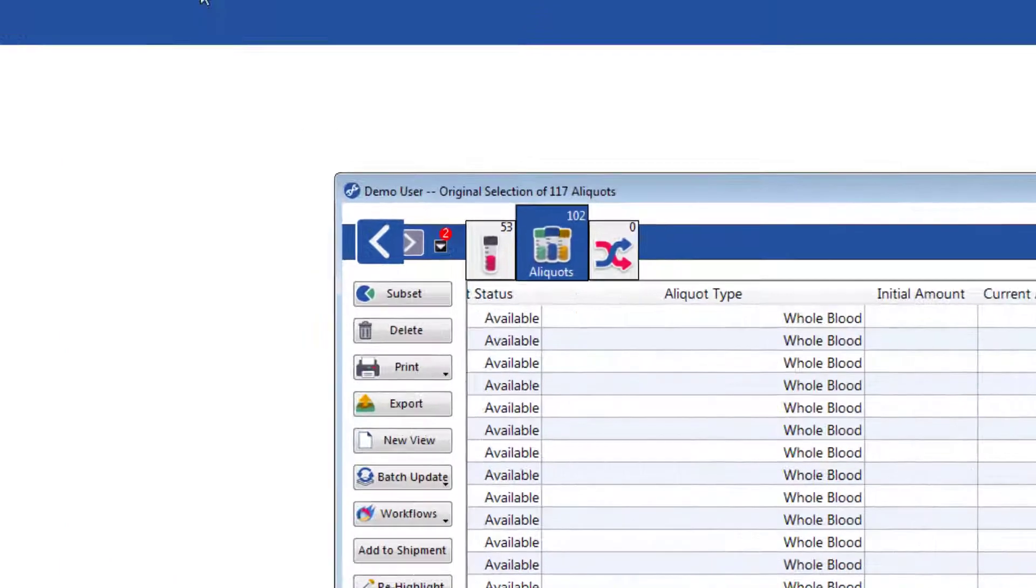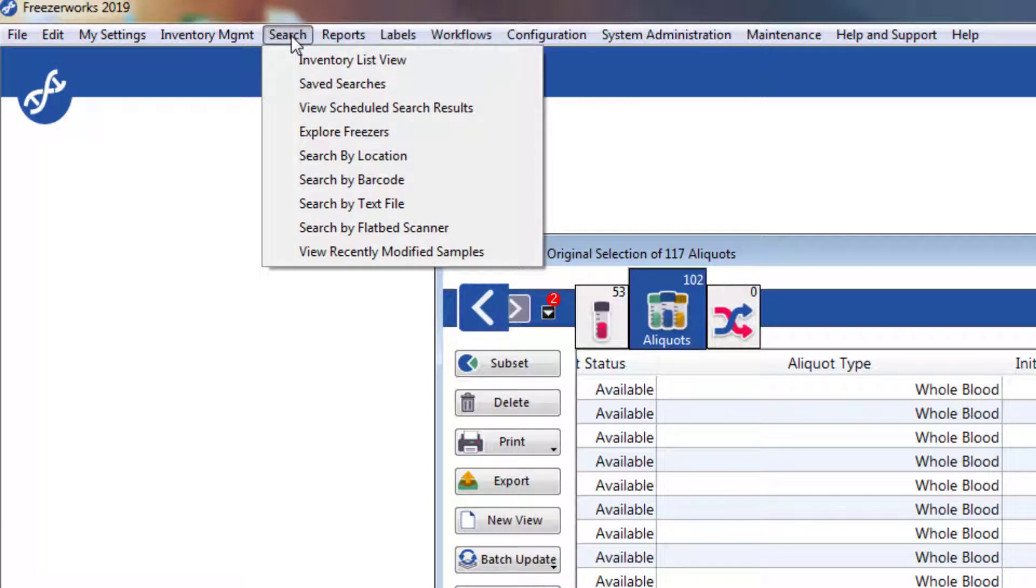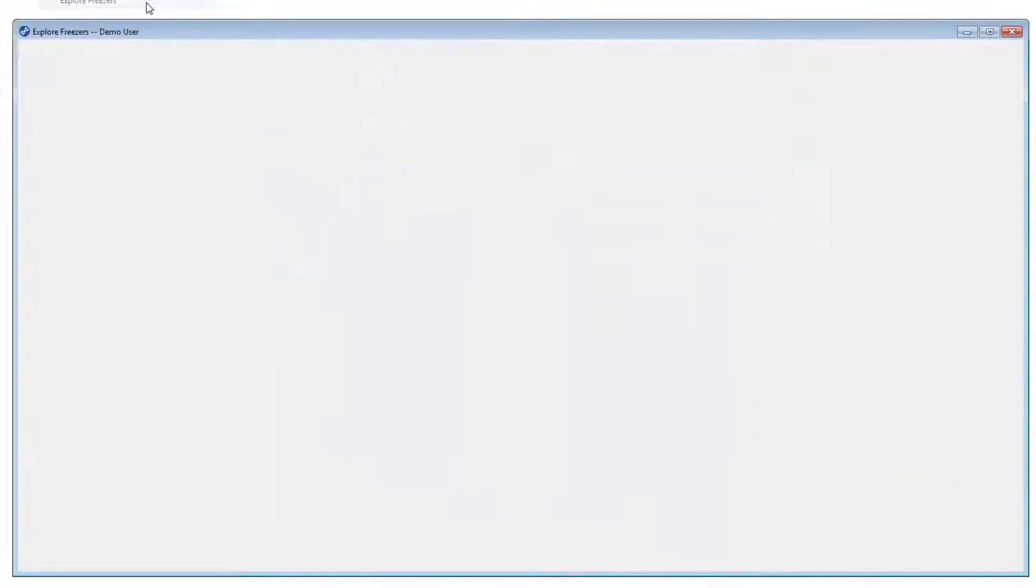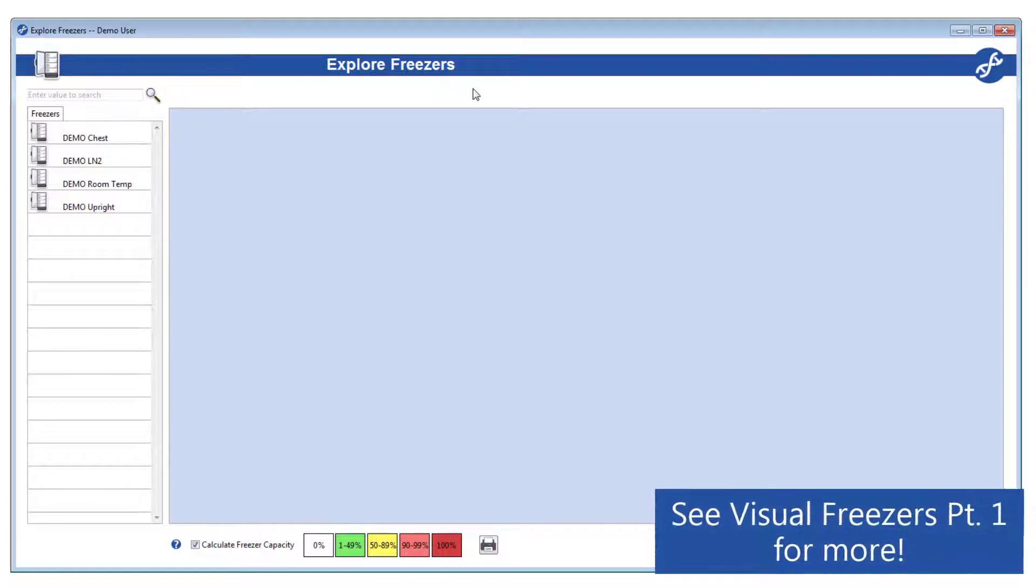You can see all of the available search options by opening the Search menu at the top, the most interactive of which is Explore Freezers. Learn more about this tool in our Visual Freezers Part 1 video.